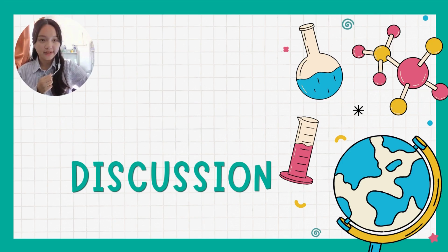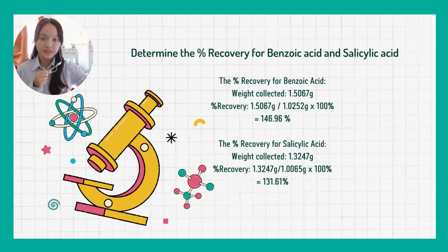My name is Rihanna Rainer, and today I will be presenting about the discussion part for this video and this experiment. So first of all, it is the determination of percent recovery for both benzoic and salicylic acid.